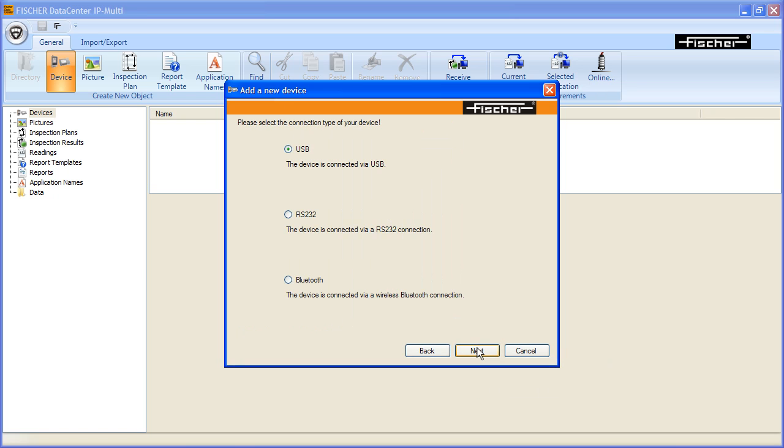A selection window appears. There you can select the type of connection between the device and the computer. Select the type of connection and click Next.